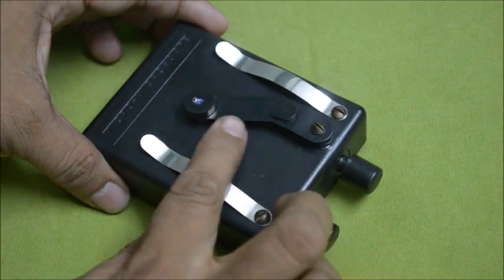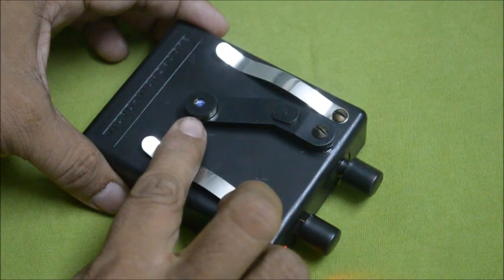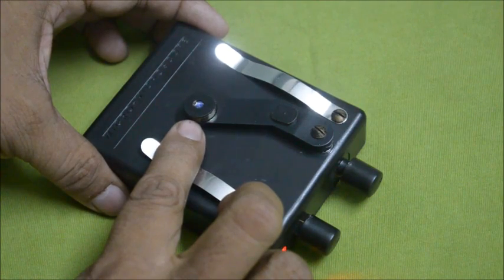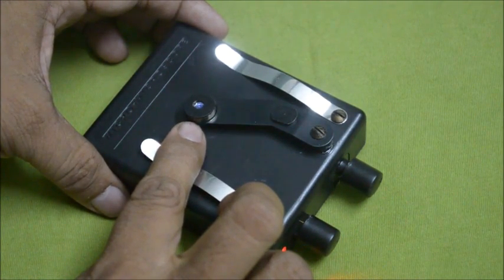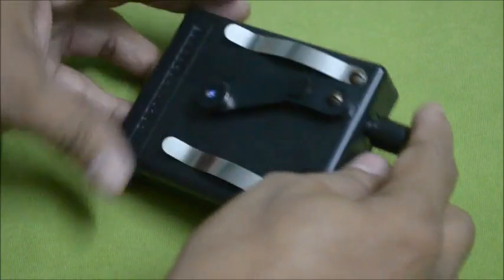This one is the viewfinder plate, and this is the viewpoint through which you can see the magnified image of the specimen or slides. This is the main body of the micro microscope.